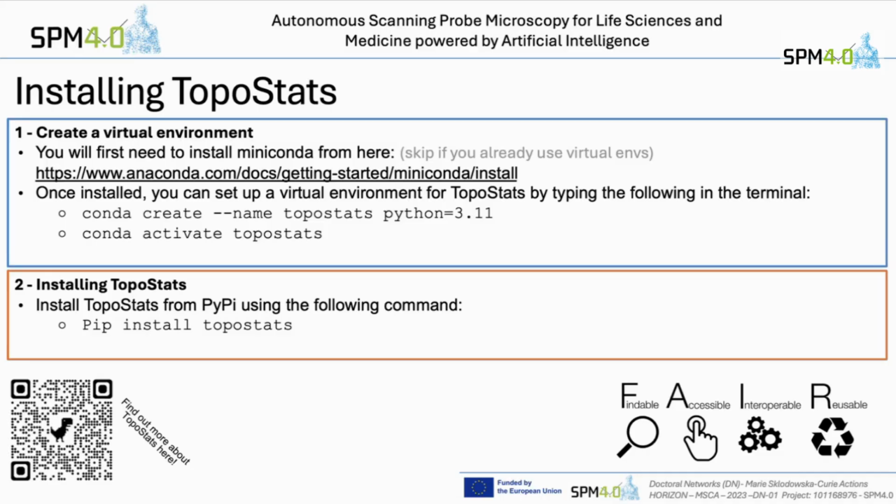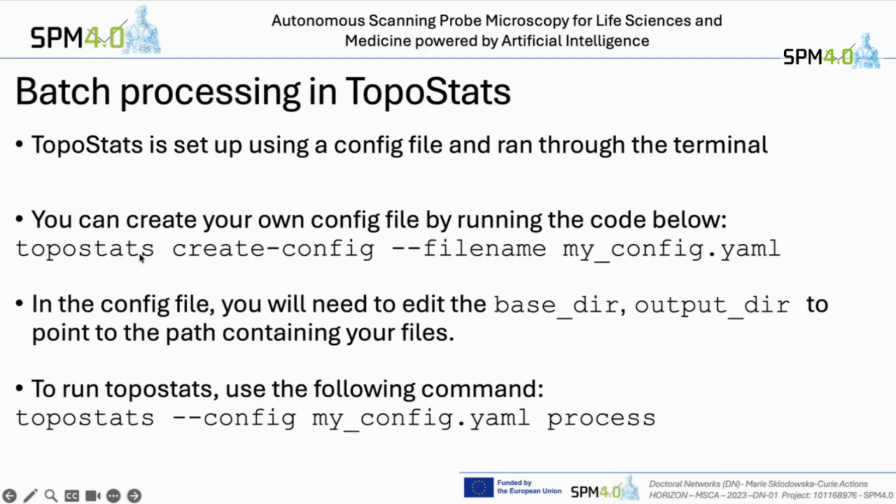So once you have installed whatever you're installing, you need to create a virtual environment. If you are using Conda, if you're on Windows, you need to go into the Anaconda PowerShell prompt, I think it's called. If you're on Mac, just go into Terminal and type this first line here.